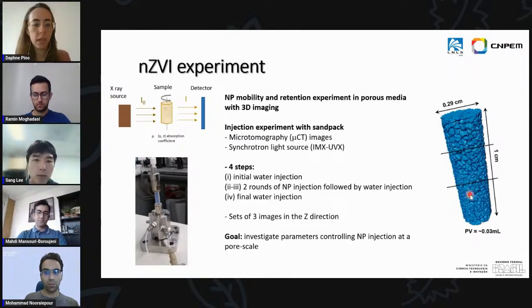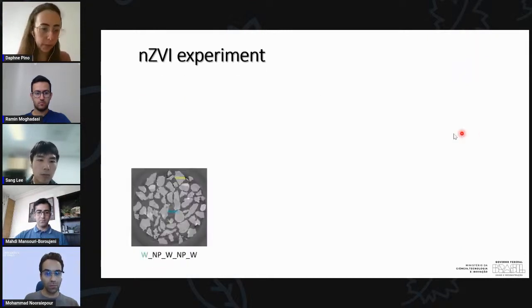Something interesting about this experiment is that we were imaging this sample, which is about 1 centimeter long. We were imaging in 3 sections, so we had better resolution for a long sample. So if you never saw one of these images, this is about what you got. It looks a lot like a radiography. This is a tomography image.